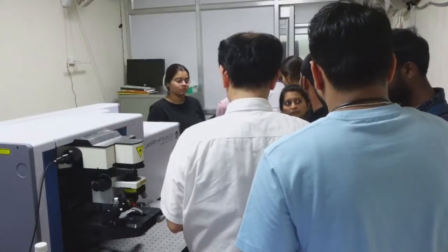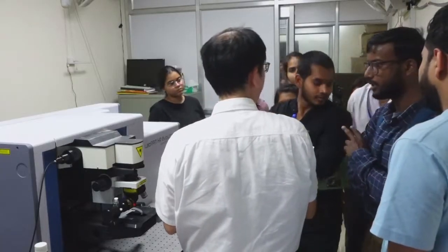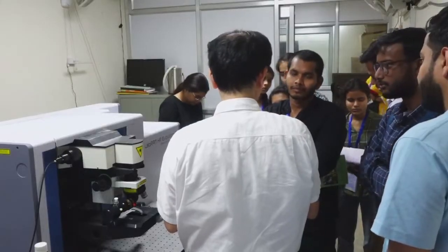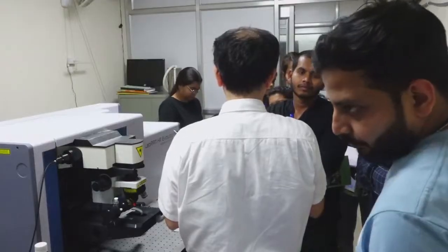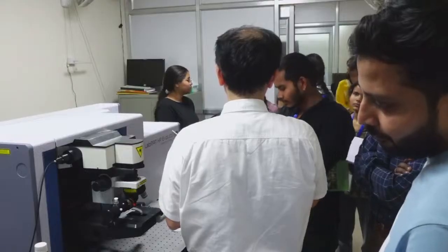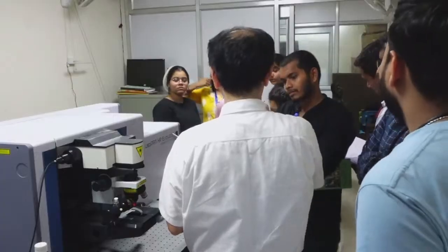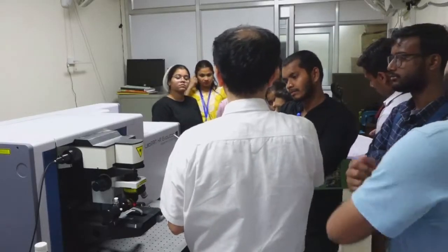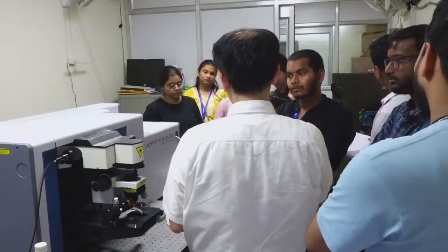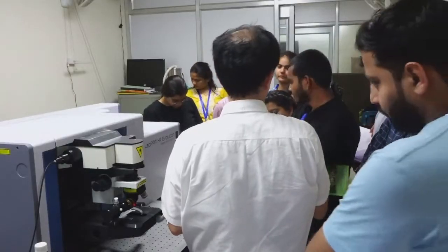Sir, in your slides you mentioned that there are two types of filter. One is a notch filter and the other is a Bragg grating filter. What is the difference between these two filters? The principle is quite different. In the case of notch filters, the dielectric medium is layered. Multiple layers of the dielectric medium are put on the surface. And in the case of the Bragg notch filter, it's a grating. So the principle is quite different.